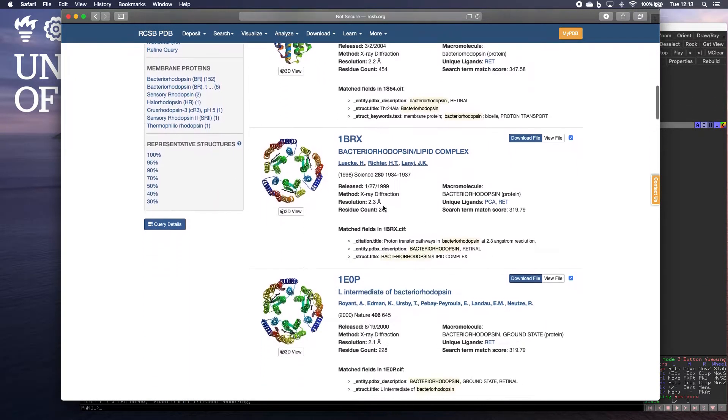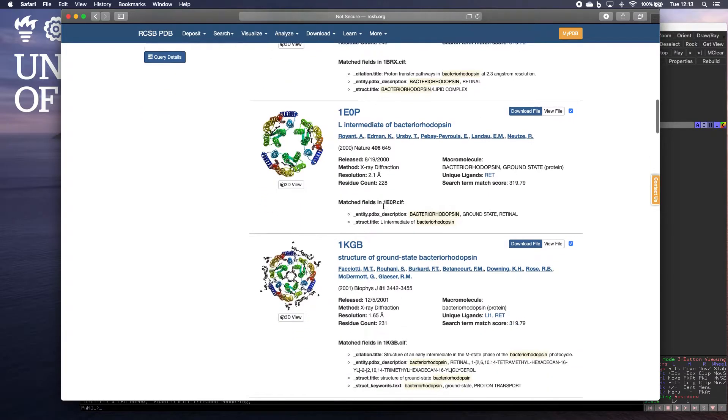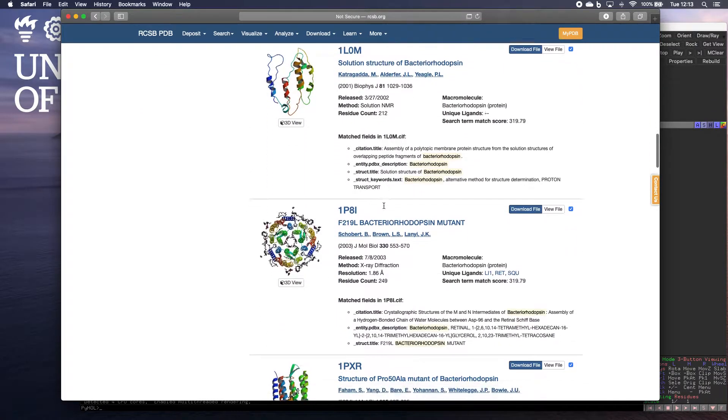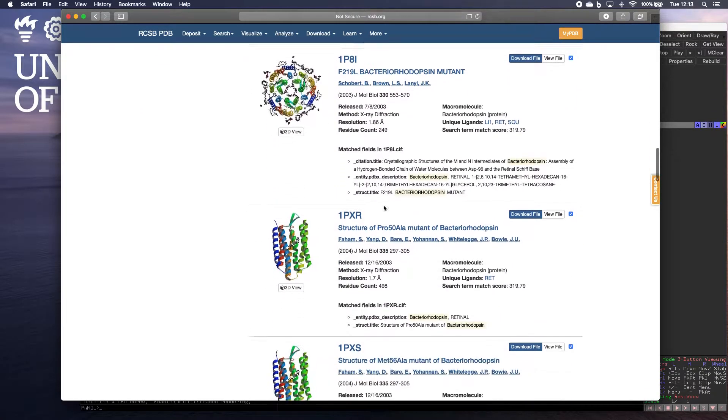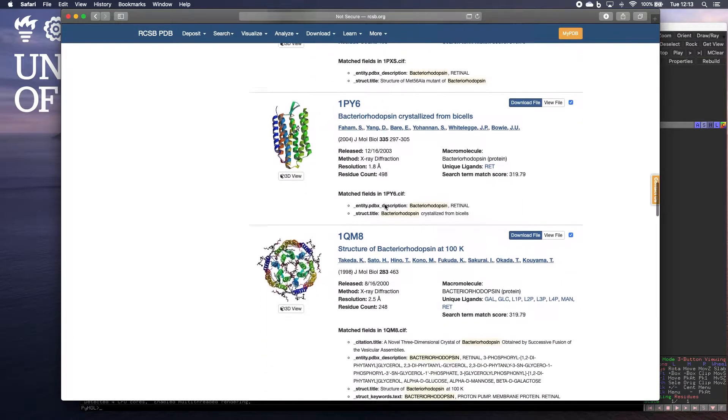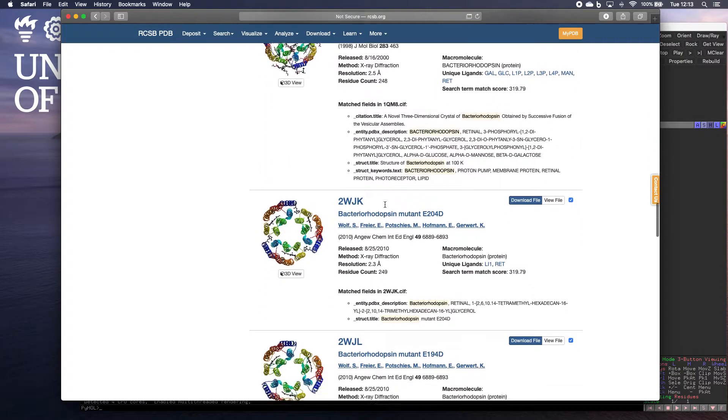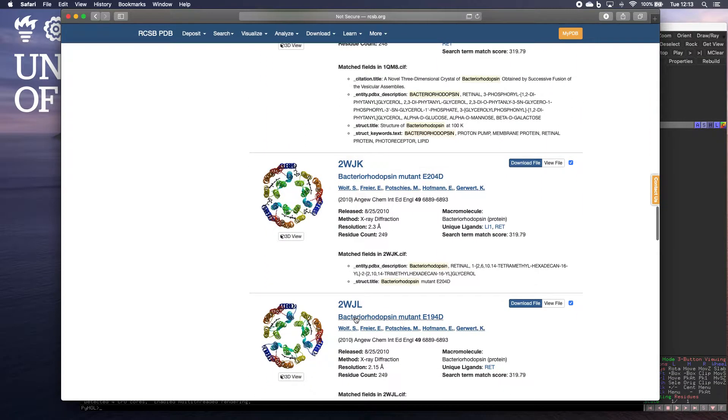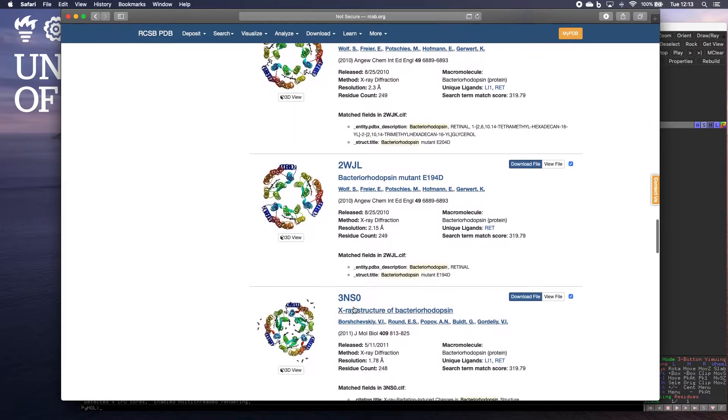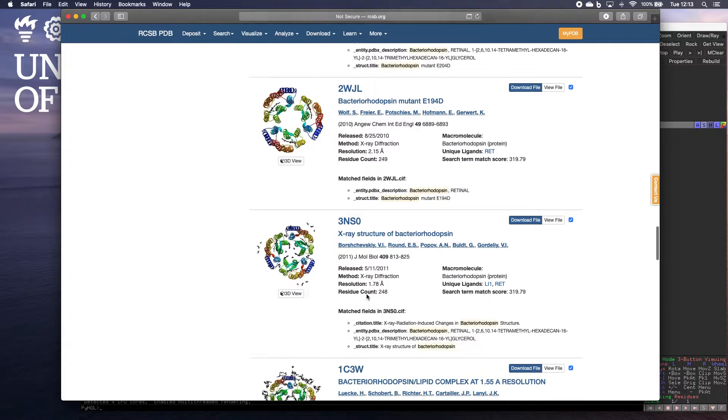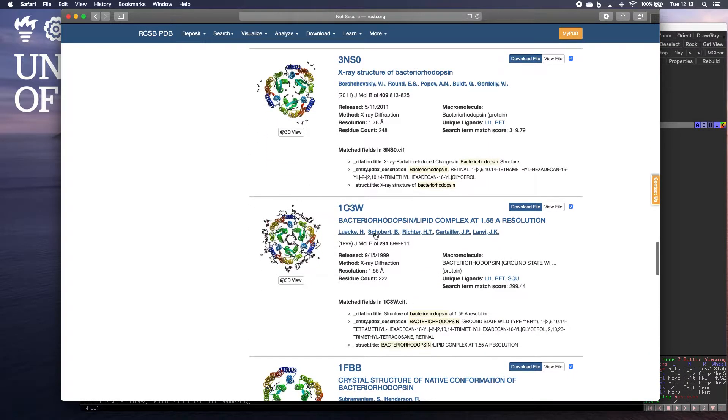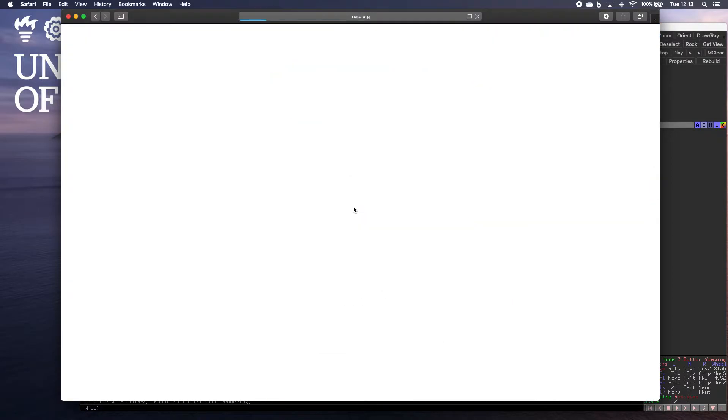And once again, we've got a whole host of different structures. Now all these structures, they all have numbers associated with them. And these are unique numbers associated with that particular structure. And we're going to take a look at this one here, 1C3W.